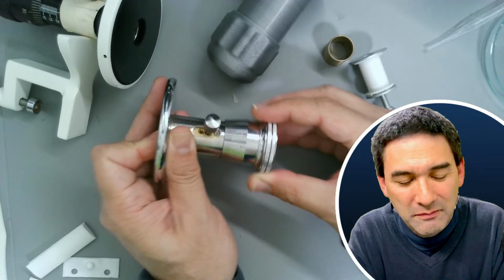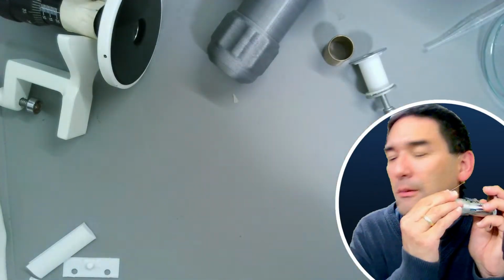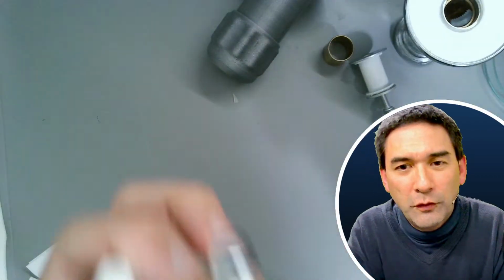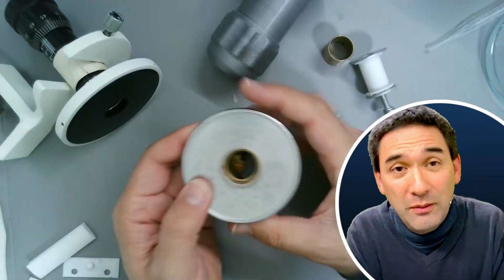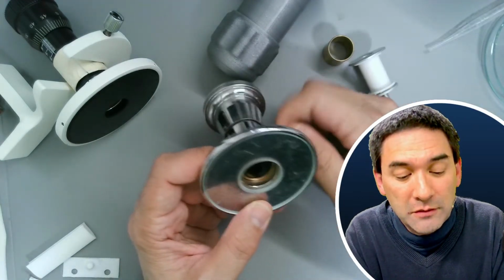Maybe you can hear it. Let me hold it next to the microphone. In comparison to this one over here, this one is not wobbly at all. This is really smooth. So for this reason, if I have to make microtome cuts, I've always been using this one over here simply because of the clamp.